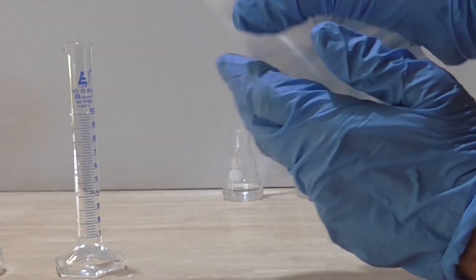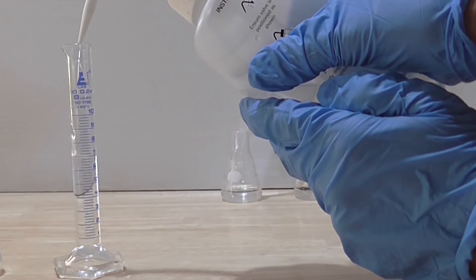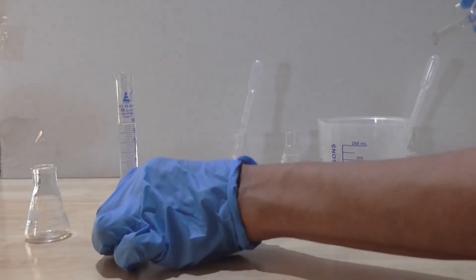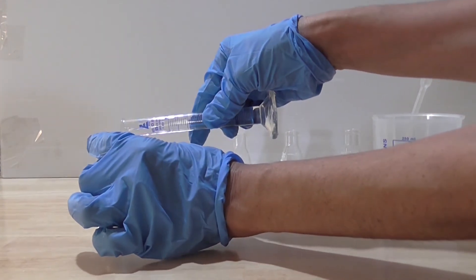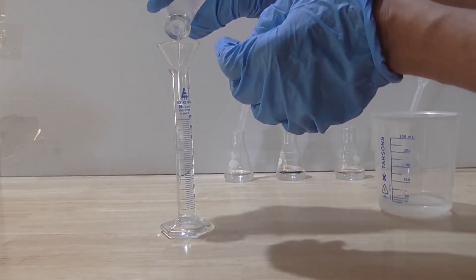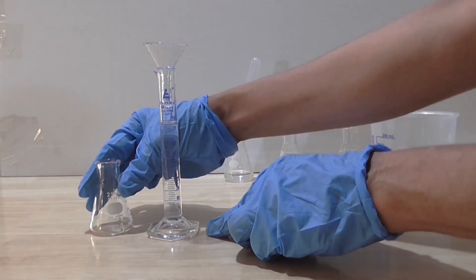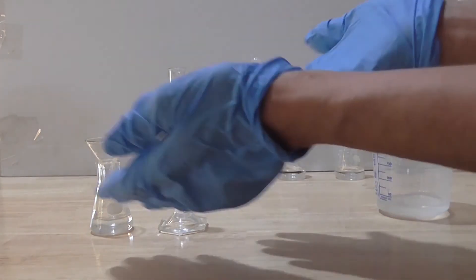Squirt in 9 ml of distilled water into the cylinder. The total volume of the acid and water is 10 ml. The dilution factor is 10. Therefore, the concentration of my newly prepared acid is 1 tenth of 0.001 molar, making it 0.0001 molar. Ensure that the acid is well mixed by transferring from one vessel to another a few times. I now have hydrochloric acid that is 0.0001 molar.